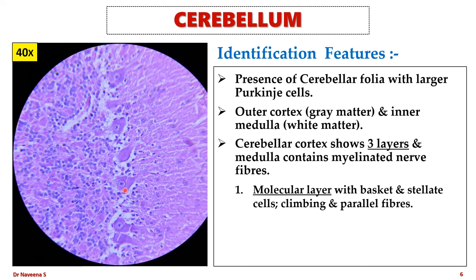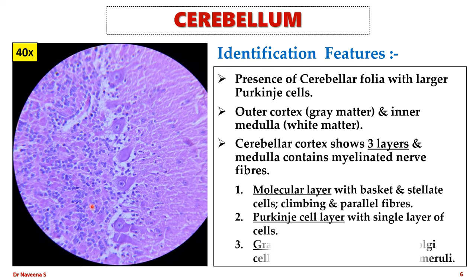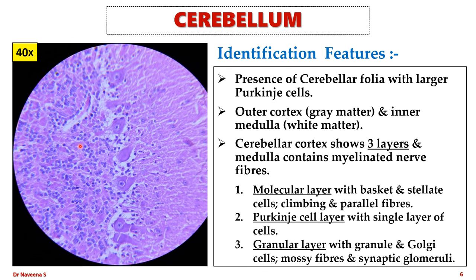The Purkinje cell layer is a single cellular layer showing flask-shaped Purkinje cells with a centrally placed large nucleus, dendritic processes projecting into the outer molecular layer, and an axon into the underlying granular layer. The deepest layer, the granular layer, contains granule cells and larger Golgi cells, along with mossy fibers and synaptic glomeruli.